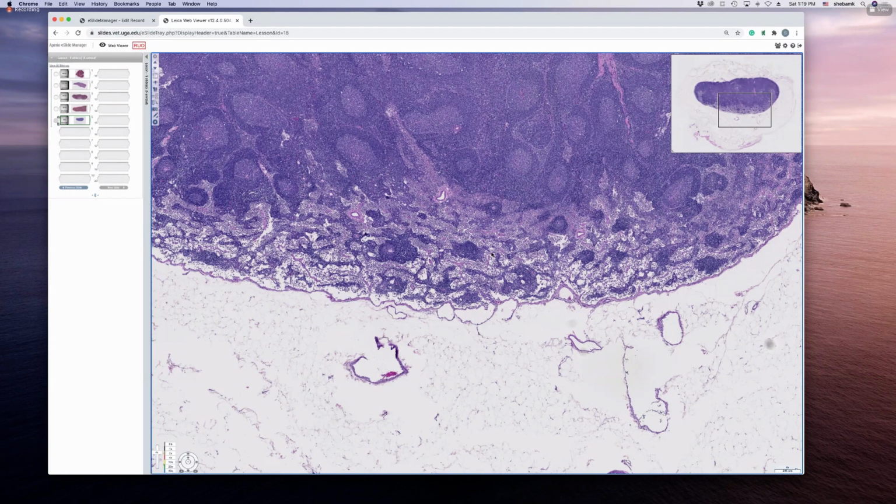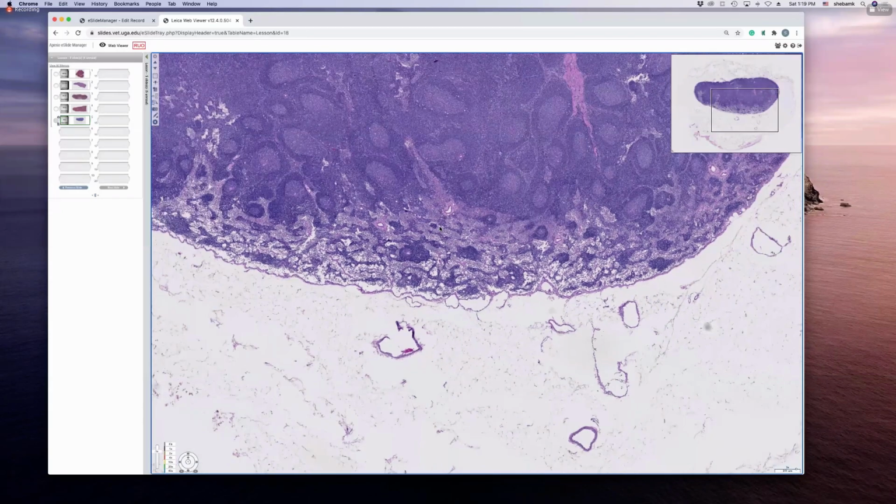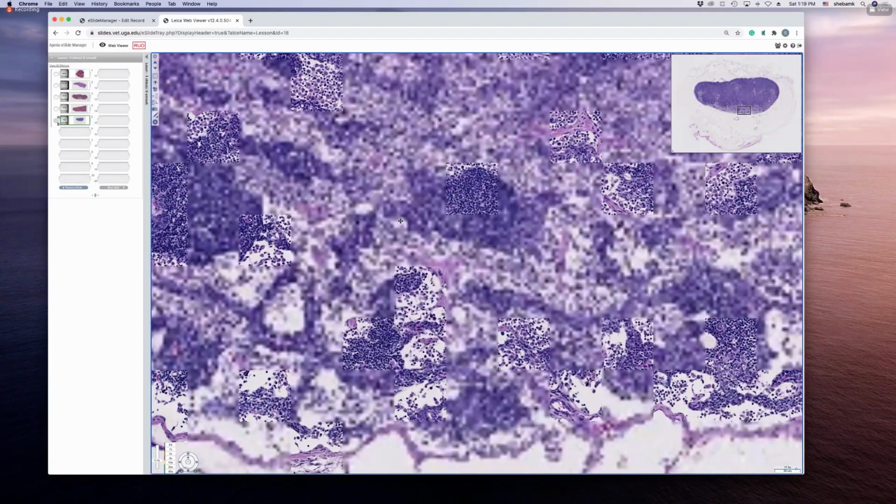So these are all sinuses, okay? Relative to the cardiovascular system, the lymphatic system, they're all going to be lined by endothelial cells. So these guys, the sinuses, contain what? Let's go take a look at it.